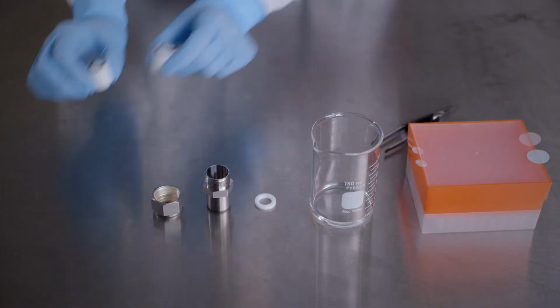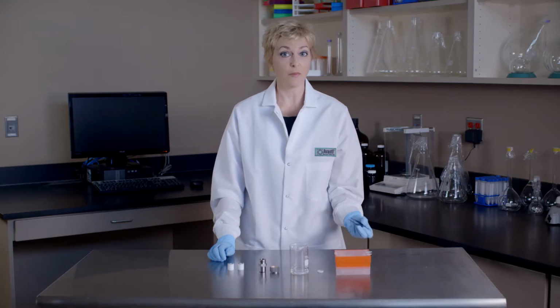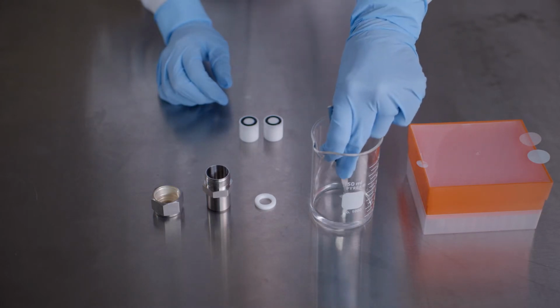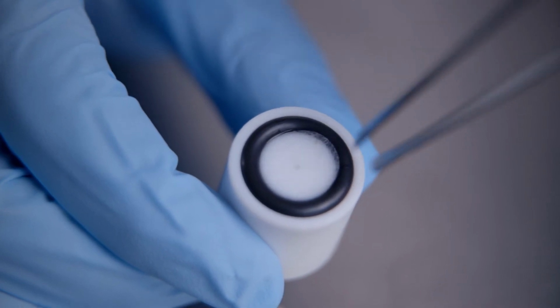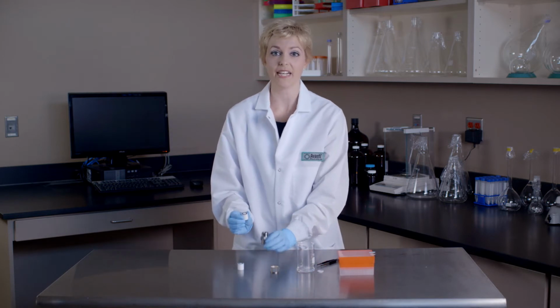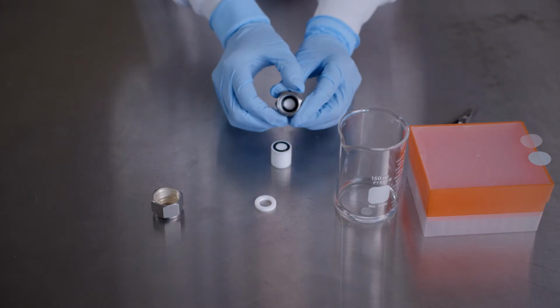To assemble the Mini Extruder, place the 2 internal membrane supports on a flat surface with the O-rings pointing upward. Then we're going to pre-wet 2 filter supports in DI water or buffer. Next, we will place one of our pre-wetted filter supports over the Teflon orifice on the inner diameter of the O-ring of one of our internal membrane supports. Next, we will place the internal membrane support containing the filter support into the extruder outer casing with the O-ring facing upward.